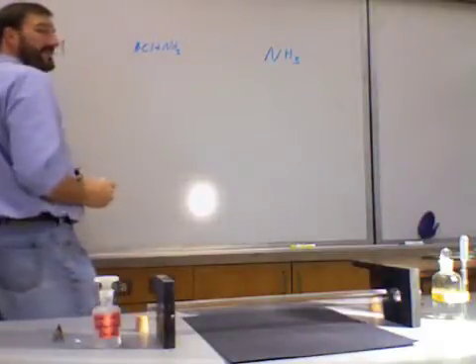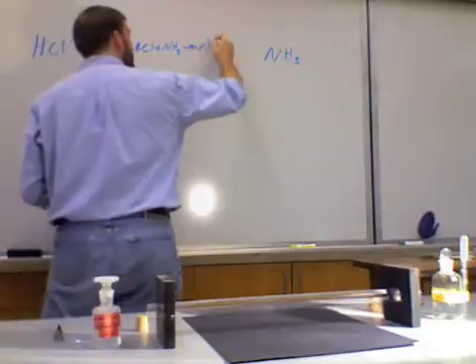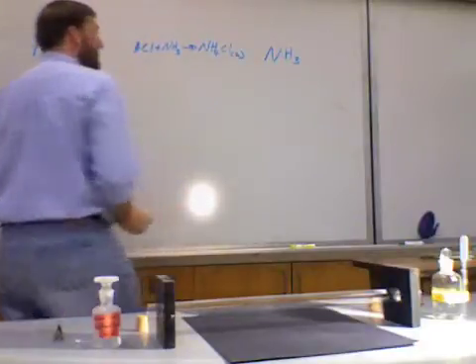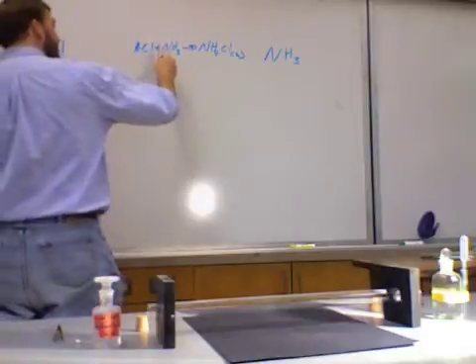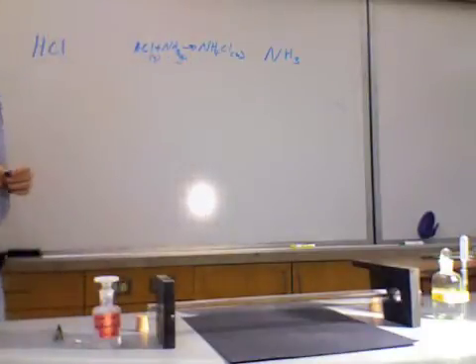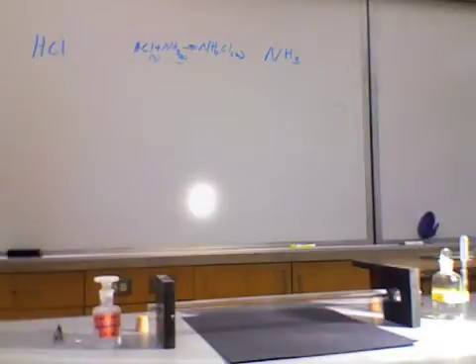will react together to produce ammonium chloride, which is a solid. So we're going to start with two gases. They're going to meet together and produce a solid. That solid happens to be a white. So we're going to look for that formation taking place. And that's kind of why we have the bright light here. Try to make it a little easier for you to see.